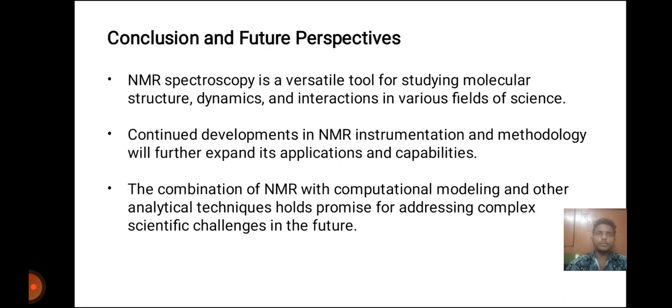Conclusion and future perspectives. NMR spectroscopy is a versatile tool for studying molecular structures, dynamics, and interactions in various fields of science. Continued developments in NMR instrumentation and methodology will further expand its application and capability. The combination of NMR with computations, modeling, and other analytical techniques holds promise for addressing complex scientific challenges in the future.